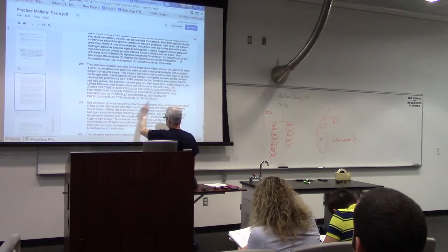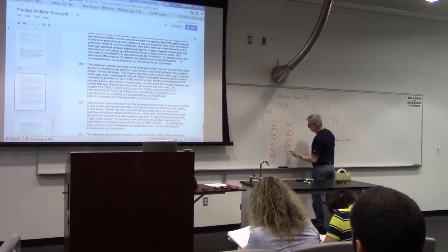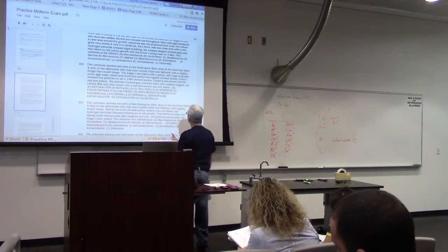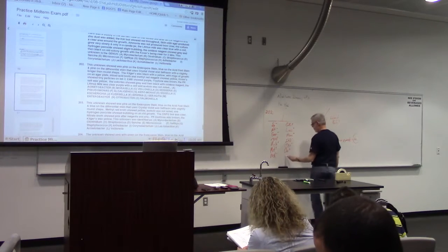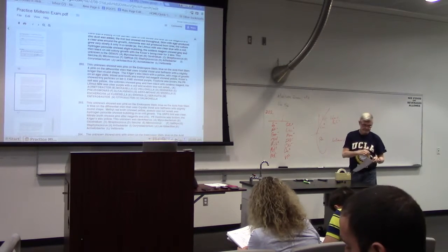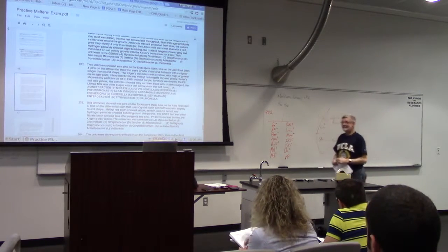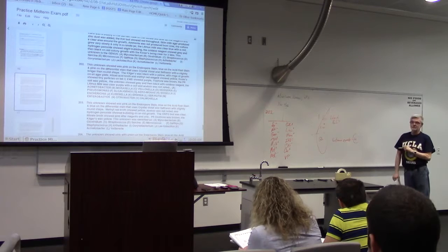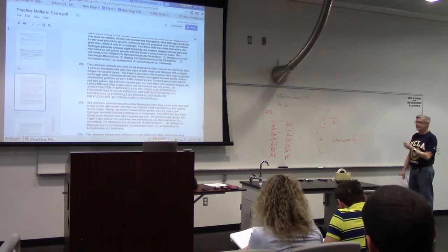All right. Clear means casein was positive. Acetoin was not noted, so VP is negative. So now we're going to look on the gram-negative side of our chart. We're going to have a problem. The problem is we can assume from this that the yellow was probably lactose, but it doesn't tell us whether it was yellow all the way through or yellow after. So you're going to have to write if.